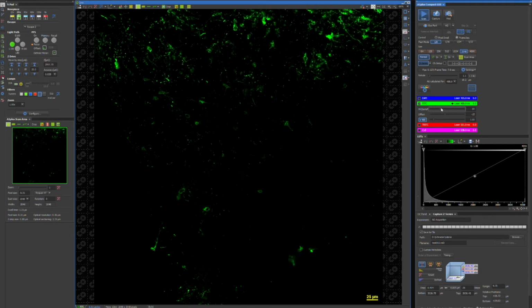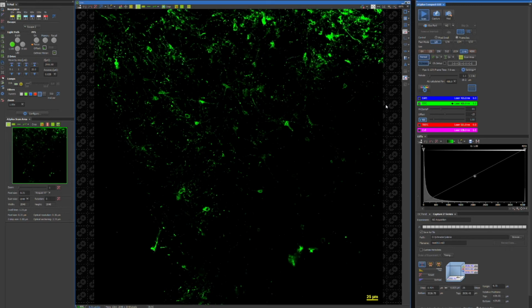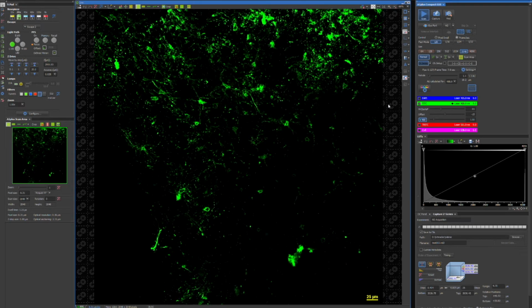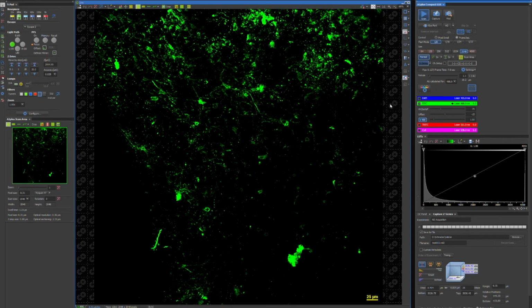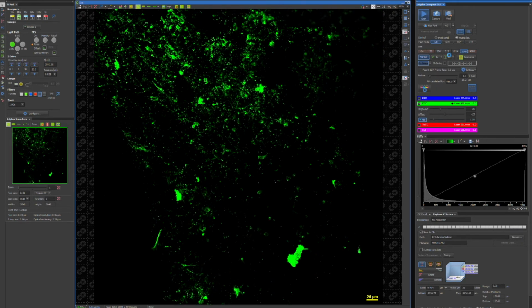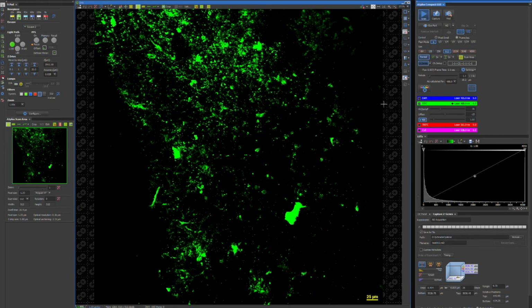I'm having a hard time finding full and clearly labeled neurons though, so I'm going to briefly switch to the eyepiece view since rendering on the software takes a long time. This screen recording is actually sped up, so switching to the eyepiece means I can quickly scan the whole slice without having to wait for each image to render. There's a lot of cool structures, but I came across this one neuron which just radiates in all directions. And I really want to get a closer look.